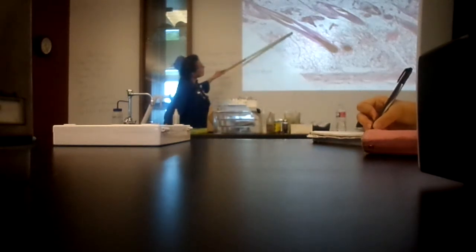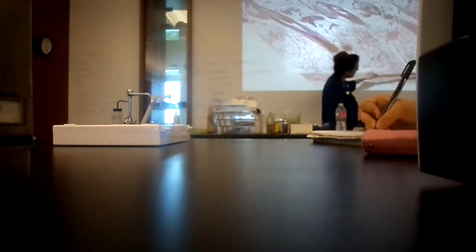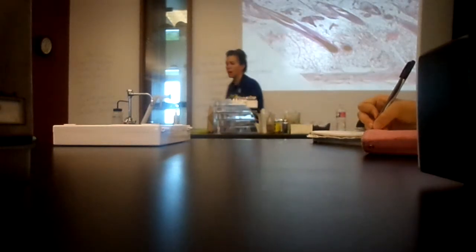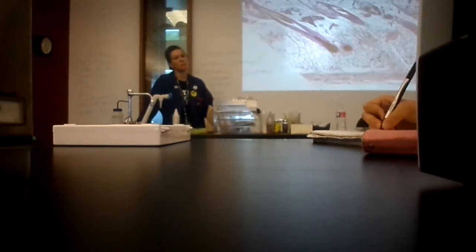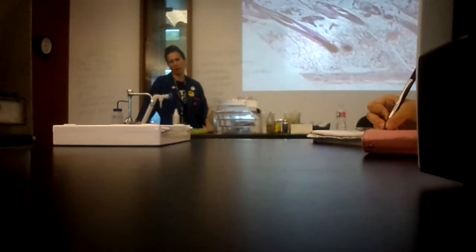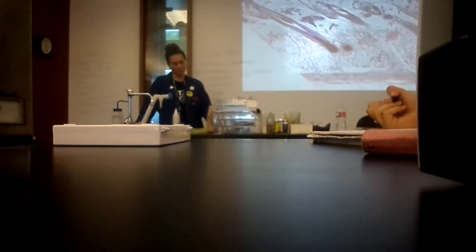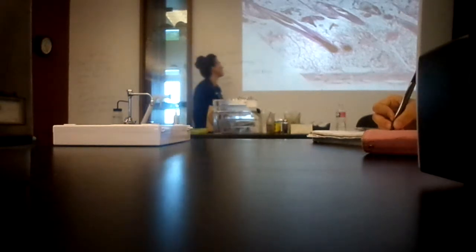And then about here, across and down, is going to be the bottom layer of the skin, which we call the hypodermis, or the subcutaneous layer. Okay? What was the first one? The first is the epidermis. All right, I'm going to go on a higher power, and I'm going to look at the epidermis in a little bit more detail.